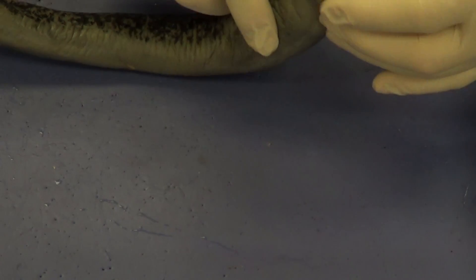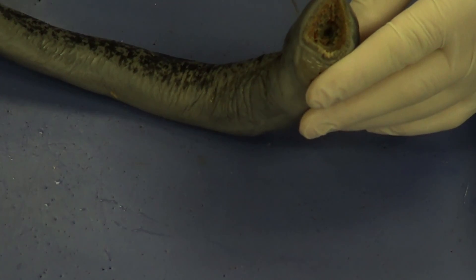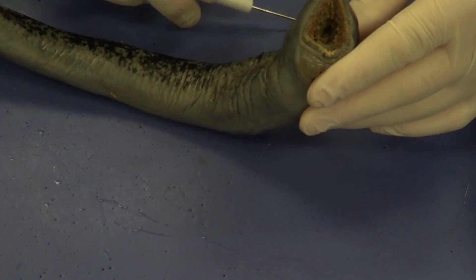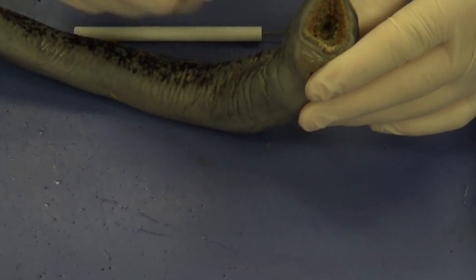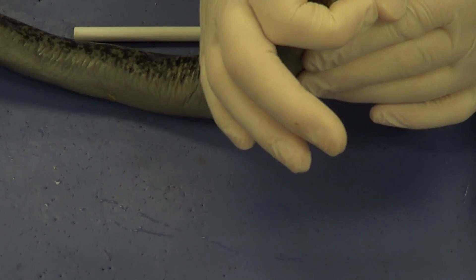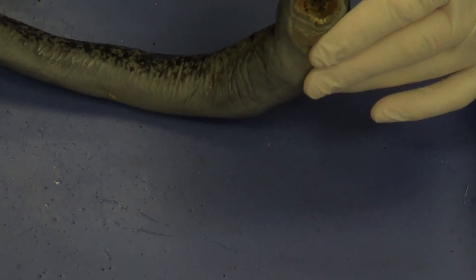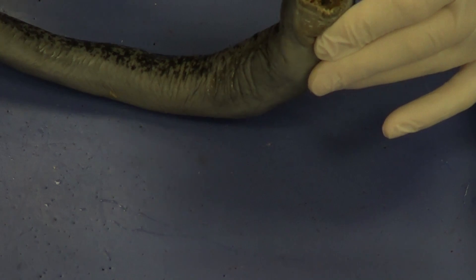You can see that the lamprey is a jawless fish. It has a circular opening and a circular muscle that goes around here. It doesn't have a hinge — it doesn't open and close; it just basically squeezes. It goes up to the side of a fish, which is its prey, and squeezes and clamps onto the side. You can also see, within the buccal cavity, a lot of very sharp teeth — what we call horny teeth.